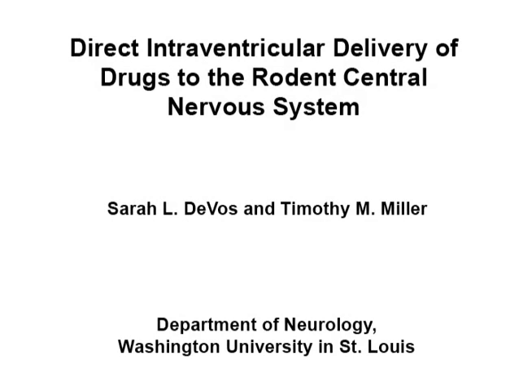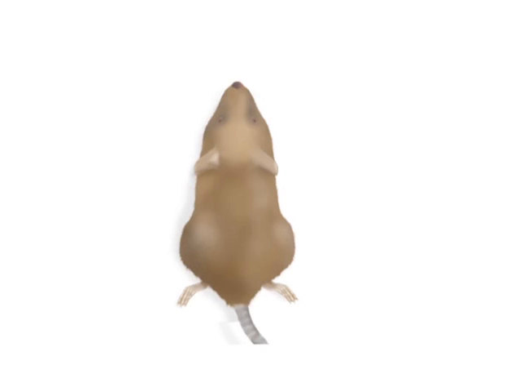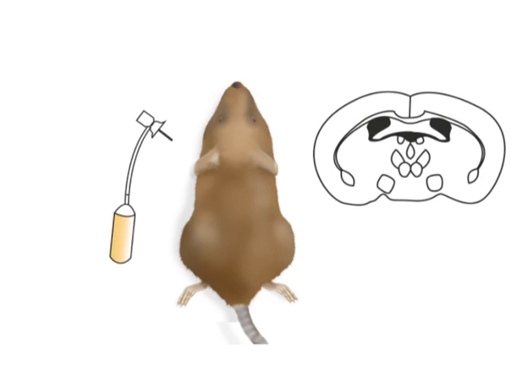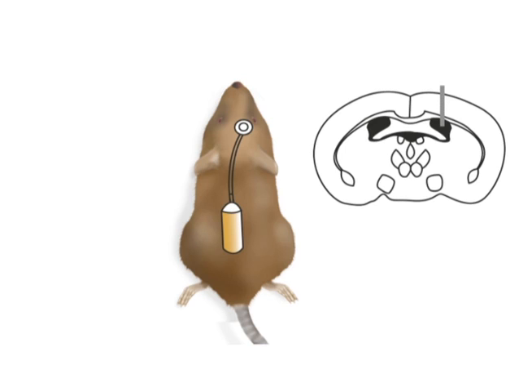The overall goal of the following experiment is to directly administer drugs, such as antisense oligonucleotides, as seen in this protocol, into the rodent central nervous system by means of the lateral ventricle. This is achieved by two different methods. The first involves surgically implanting a metal catheter connected to an Alzet osmotic pump into the right lateral ventricle of the mouse.